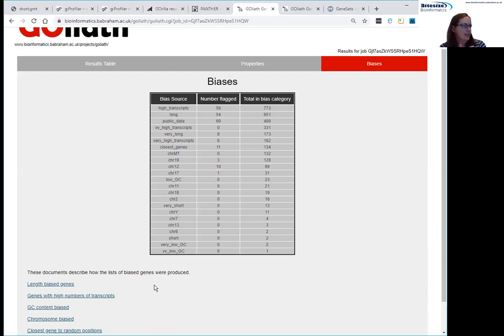So the public data sets were a few hundred mouse RNA-seq data sets from ENCODE that had 2 biological replicates, and so we just did a differential expression analysis on those.